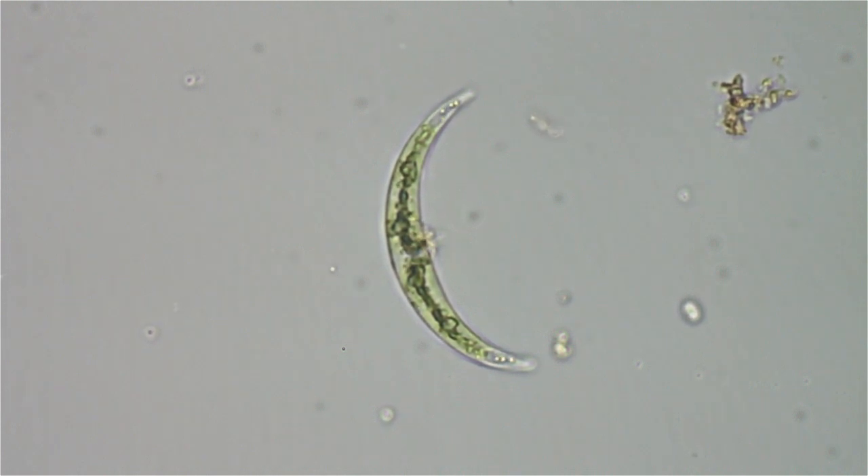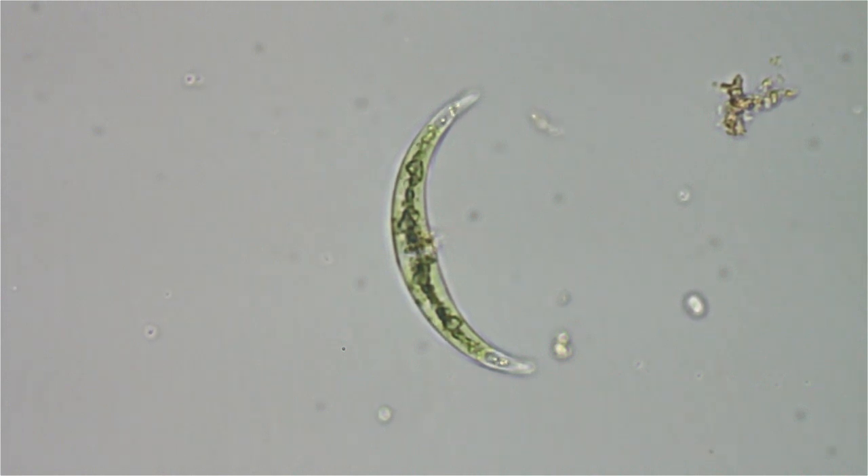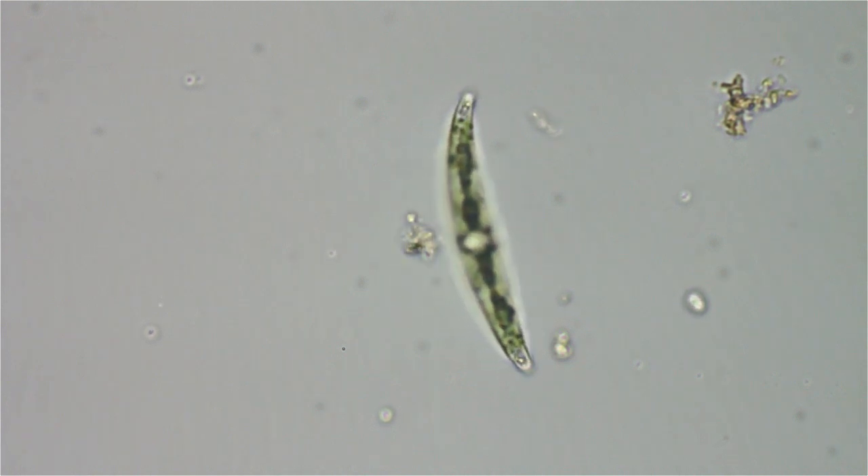I've always liked these guys because you see those little white spots in the ends there, the tips. That's barium sulfate. And there are little chambers on the ends there that are moving around, floating around in liquid. I don't know exactly what it's for — it's possibly to help him flip over.